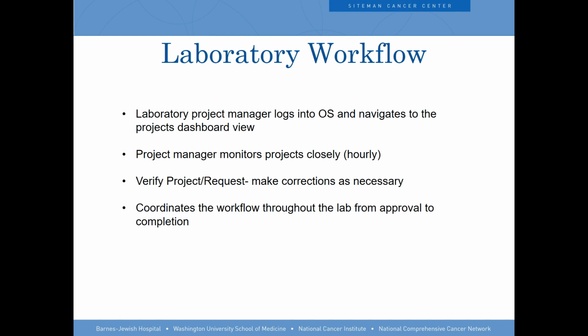Yeah, that's a good question. I don't interact with OpenSpecimen this way, so I'll probably let Lee talk more about how she thinks users interact with it. But I imagine you could look at it from the laboratory's point of view, if they're creating a pull list of, for example, specimens that actually need to be pulled again from that freezer to be processed. And then you could look at it from the requester's point of view, if they're downloading or printing a list that they can bring to the laboratory, kind of like a manifest. But Lee, do you have a sense for how that's utilized?